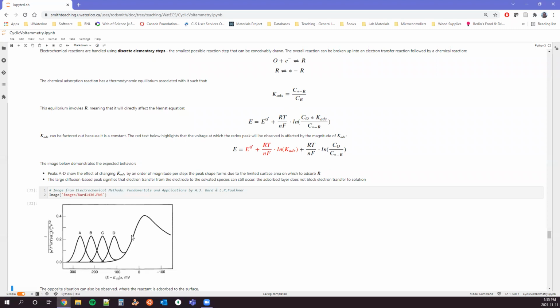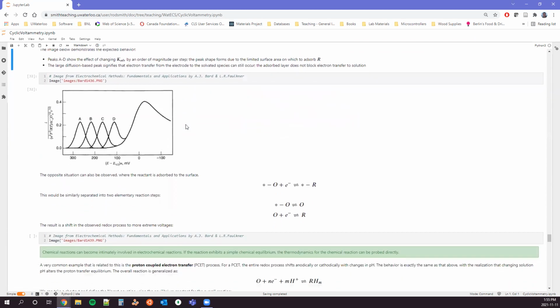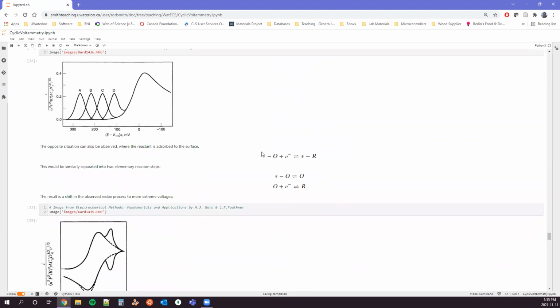And then if you see this diffusion peak going, that means there's no blocking, that you can still oxidize out into solution or reduce out into solution, right? And so by the location of this peak, we have a measure of what the adsorption strength of that species is, right? So we can directly probe that chemical equilibrium. It can go the other way.